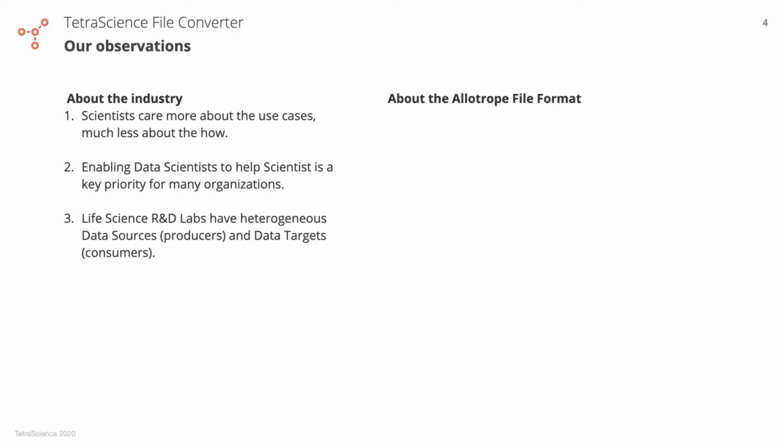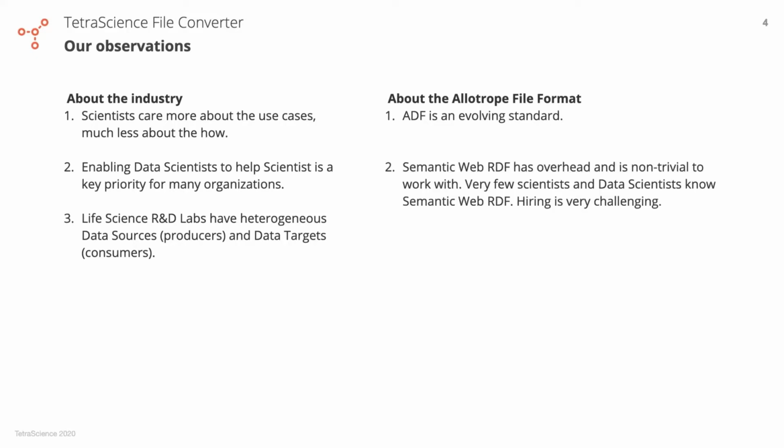We also want to provide an updated observation on the Allotrope file format. It is an evolving standard. Things are changing. Last month, the aggregation pattern was finalized, and new models and new patterns are being discussed and released. And the library is also evolving based on the feedback.